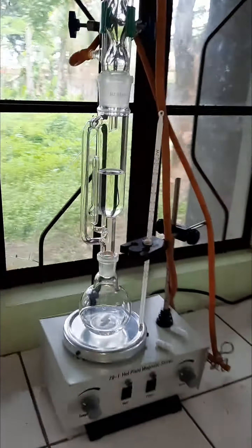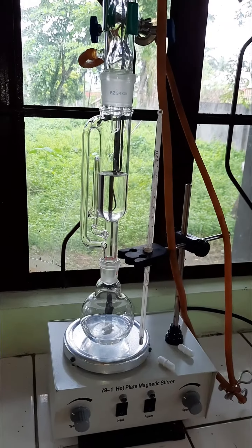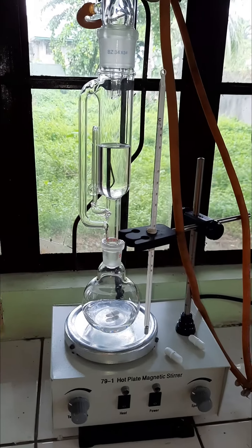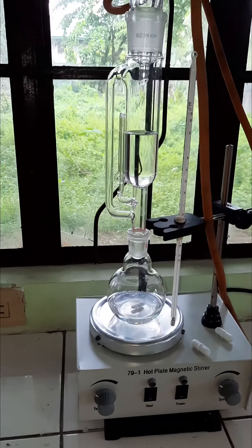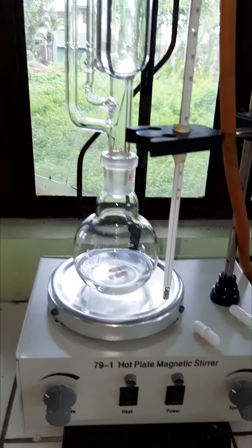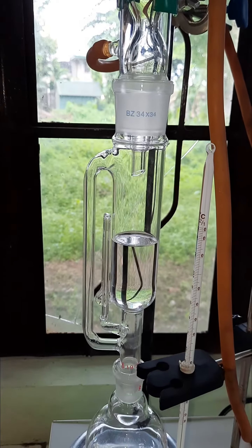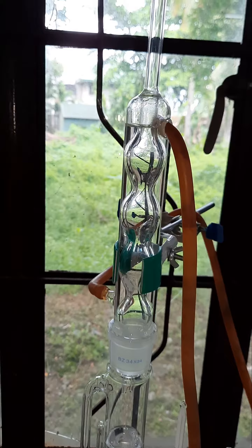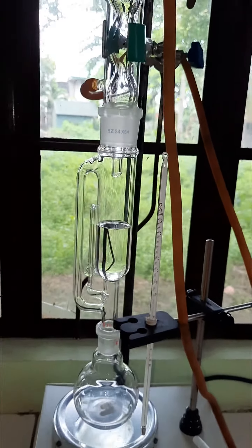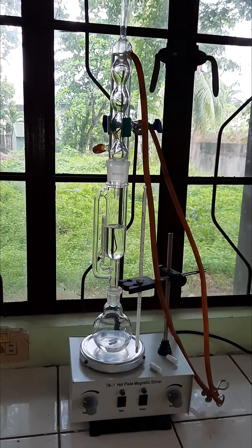Here on the other side, we have our Soxhlet extraction apparatus, wherein we will be extracting active components of a certain organic compound later on using this apparatus. So here we have our magnetic stirrer, our reaction flask, our Soxhlet apparatus, and our reflux condenser. So later on, we will witness this process as well. This is our apparatus setup for Soxhlet extraction.